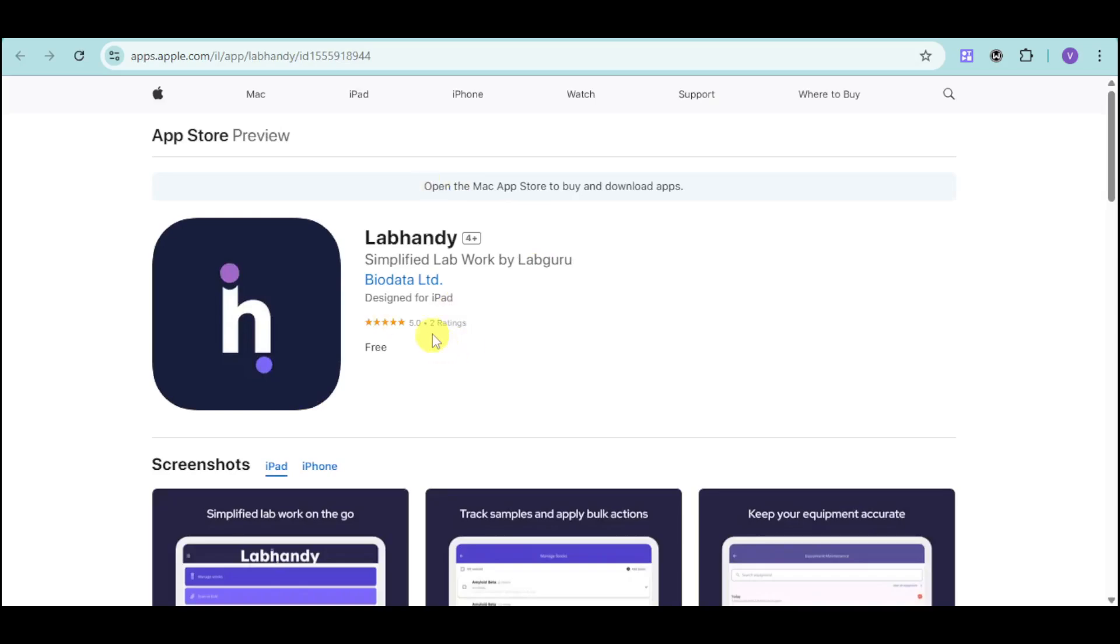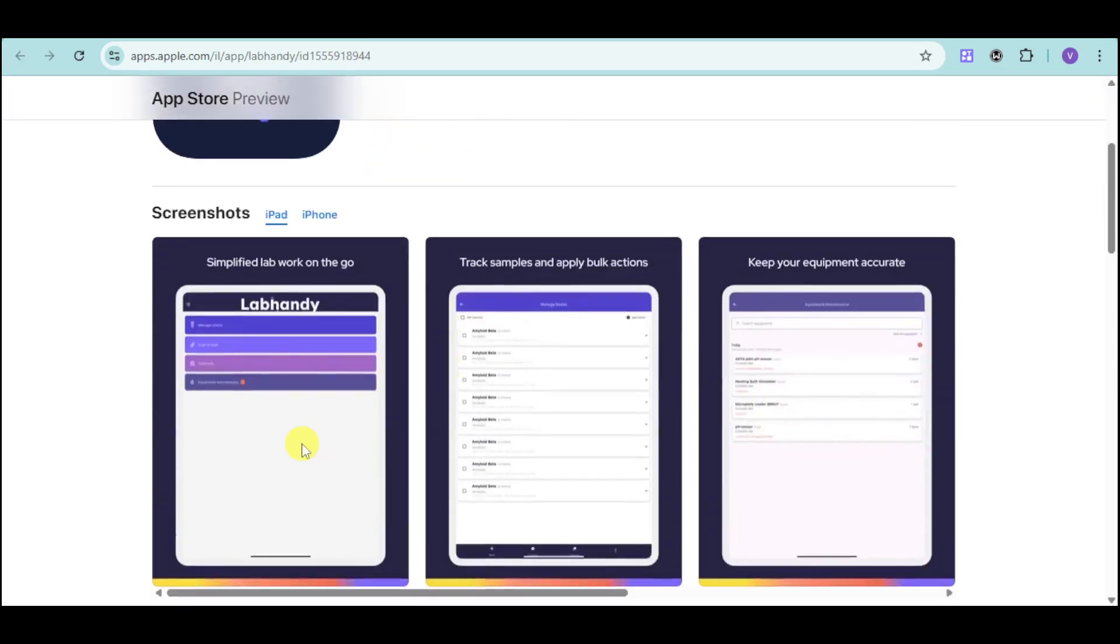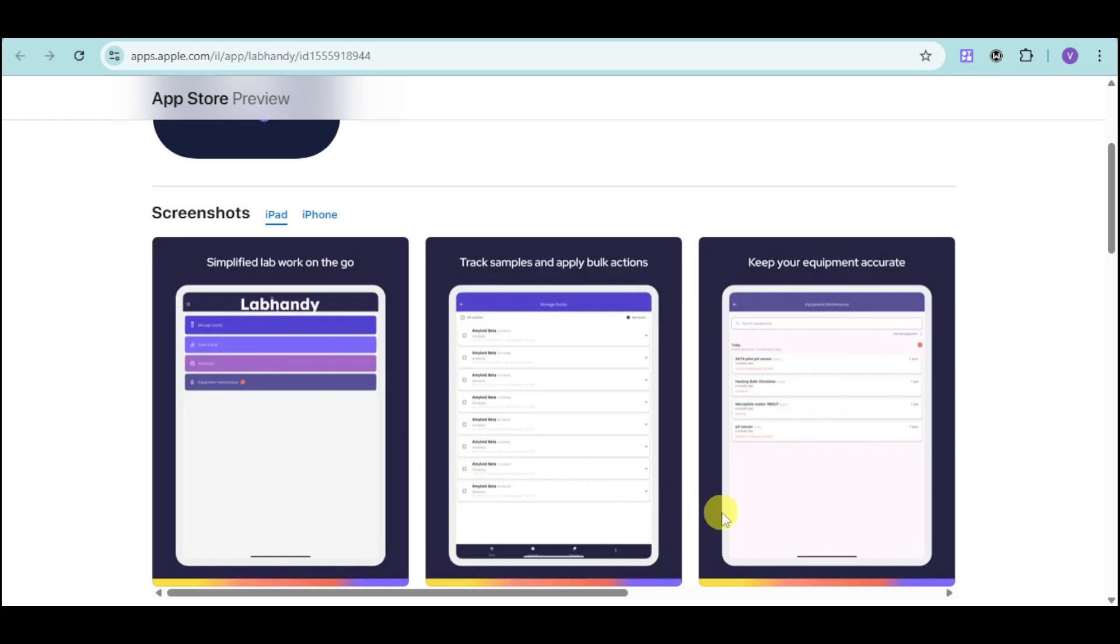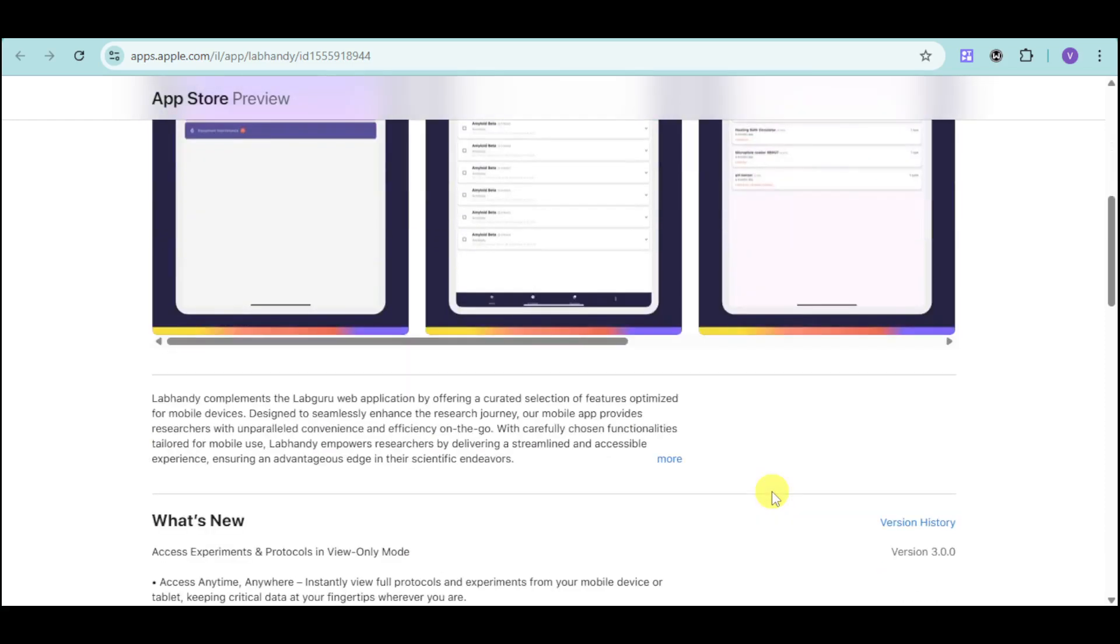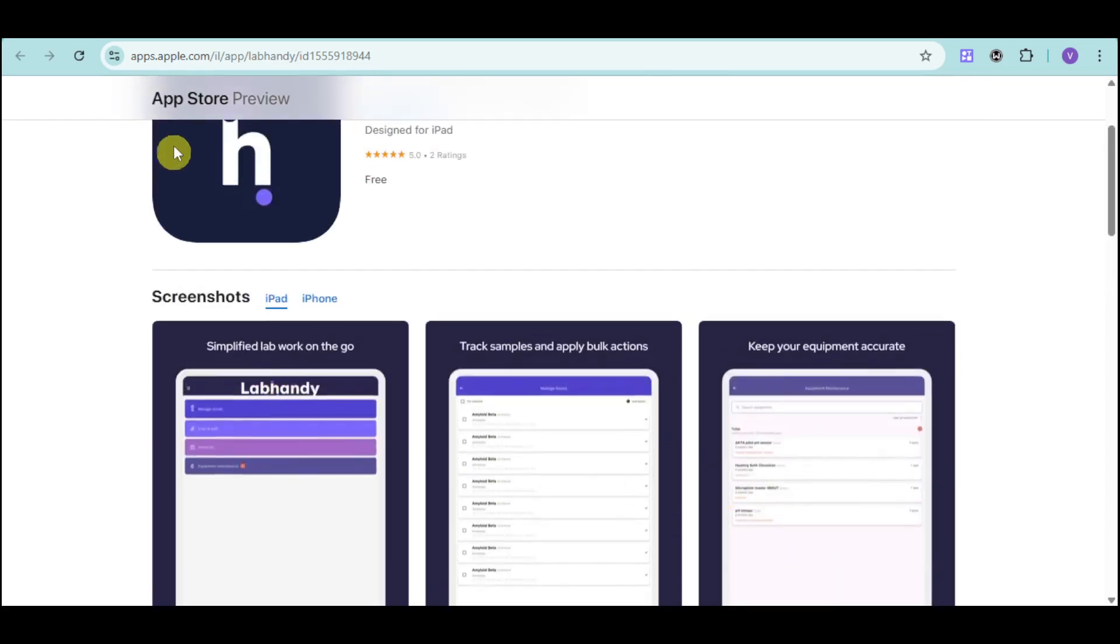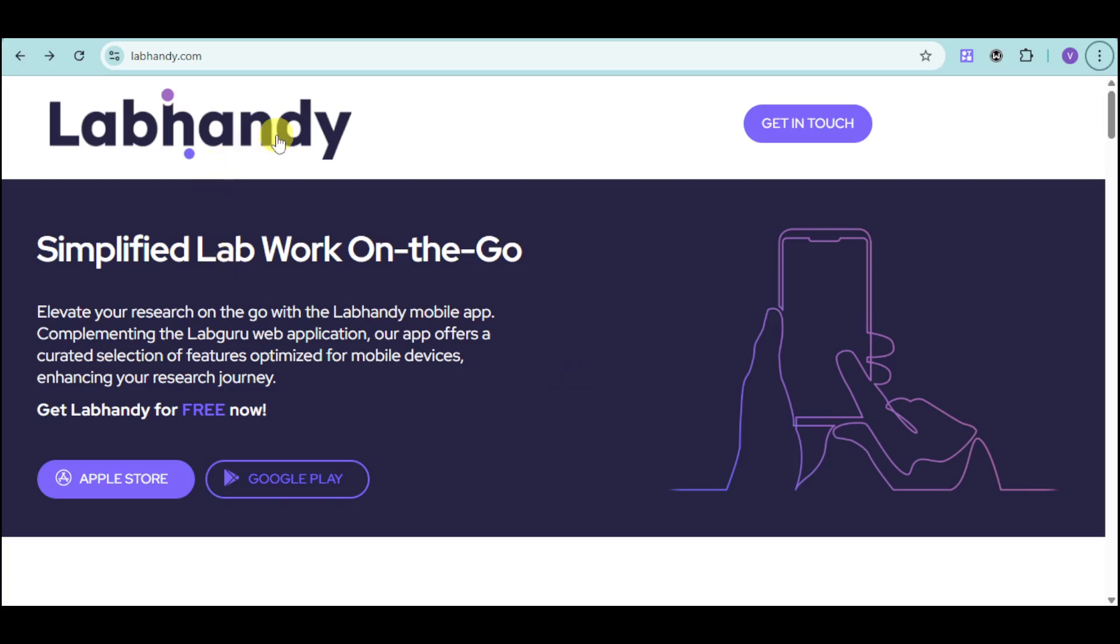It's free to install and you can see here a simplified lab work. You can track samples, keep your equipment up to date, and the likes. This is actually a plus on the direction of LabGuru because not a lot of lab softwares have this.